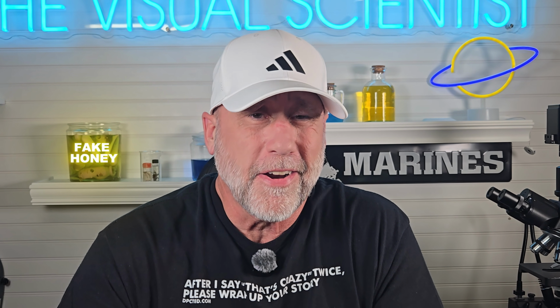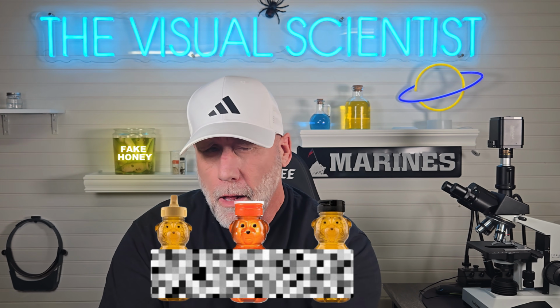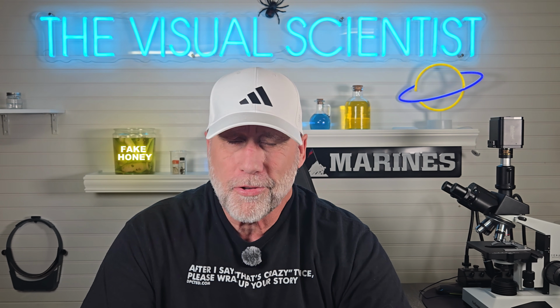I thought this was going to be a very boring video. Honey is honey, right? It comes from bees. It's in a jar. What's there to investigate? Are you kidding me? I have 3 jars right here, all purchased today from American grocery stores, all labeled 100% pure honey, or something close to it.